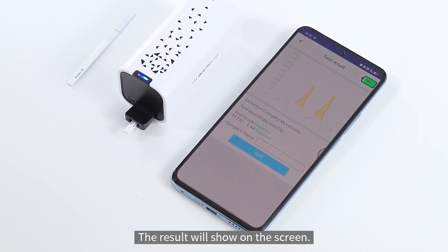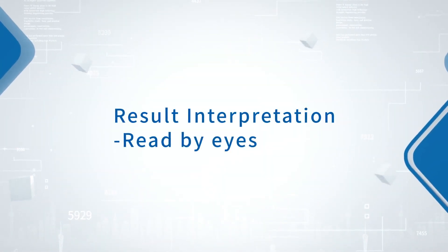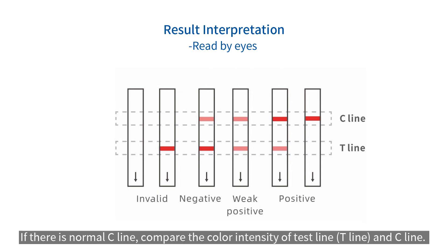The result will show on the screen. For result interpretation read by eyes: check whether the top control line is present. If there is no visible control line, the test is judged as invalid. If there is a normal control line, compare the color intensity of the test line and the control line.